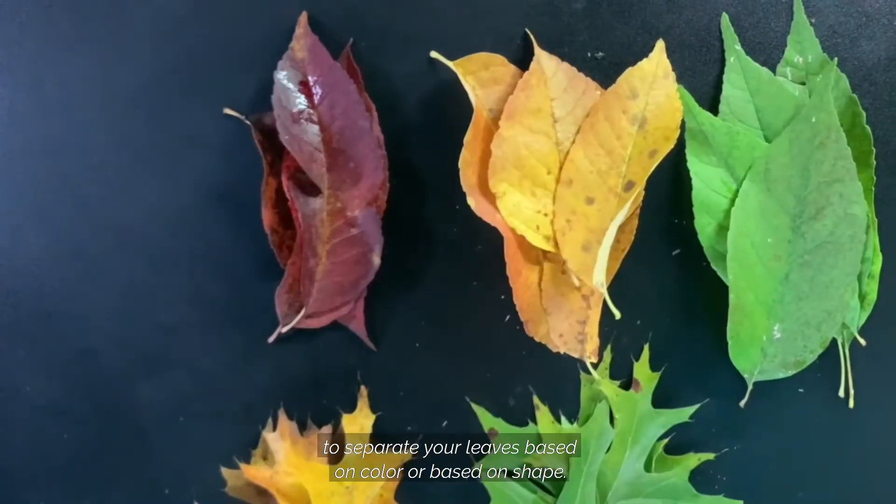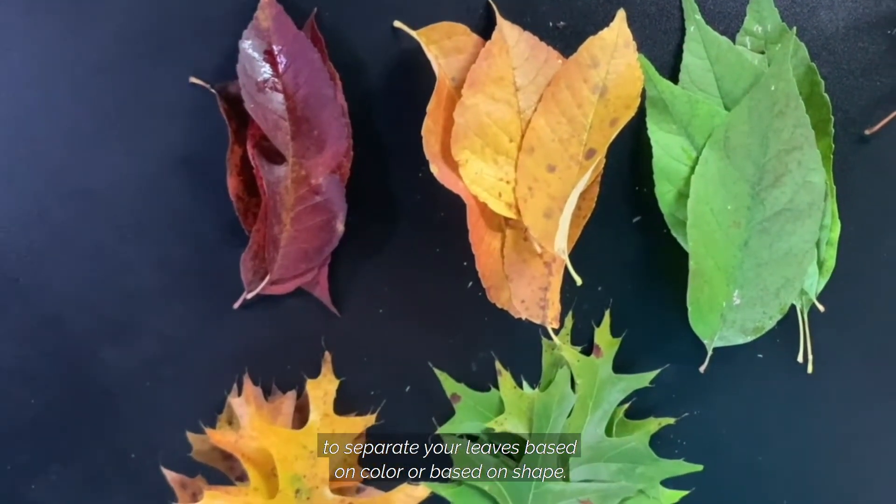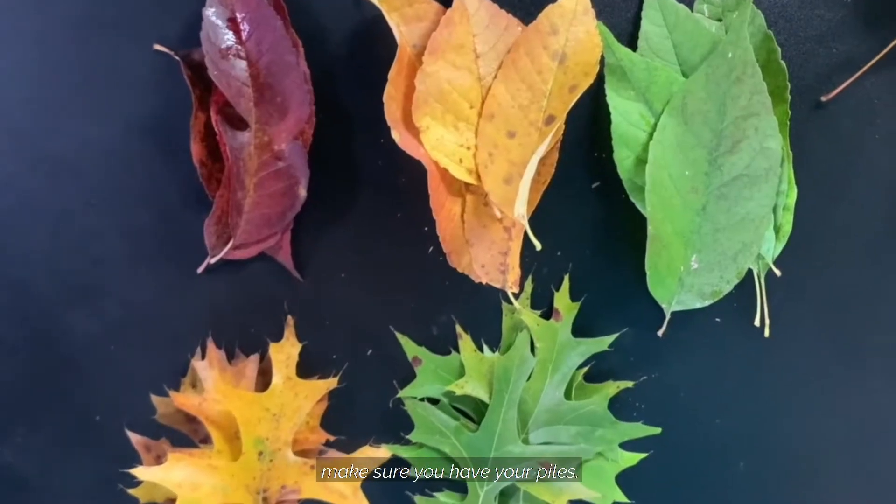Your teacher may have asked you to separate your leaves based on color or based on shape. Whichever they ask you to do, make sure you have your piles. Each pile will take one of these paper towels and one of these jars.